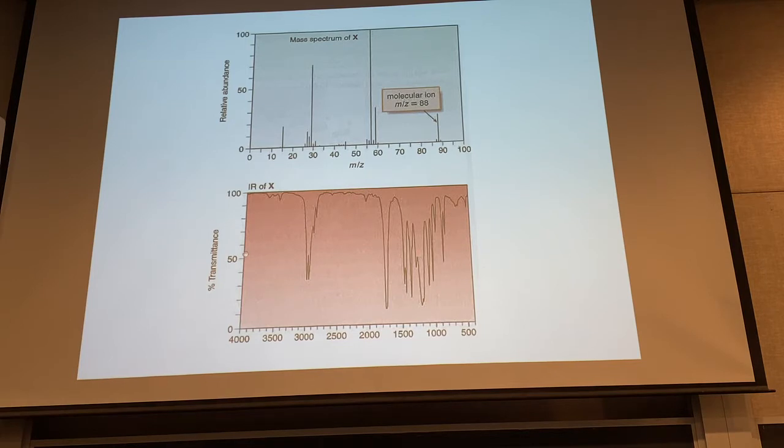What's more diagnostic, more useful, is up here, the stretch region from 4,000 down to about 1,200. And a couple things really pop out there. The big carbonyl stretch right here, 1,700. Okay, and then the CH stretches right here. There's a couple little things up here you might be tempted to say, well, it might be an amine. Might have a nitrogen, right? Remember we looked at those NH stretches?